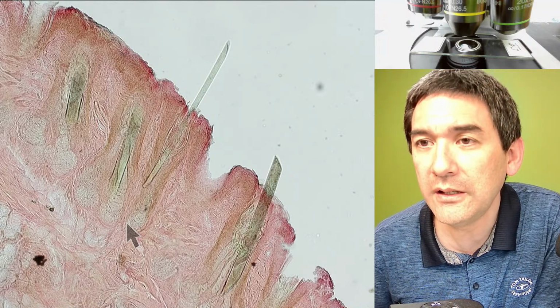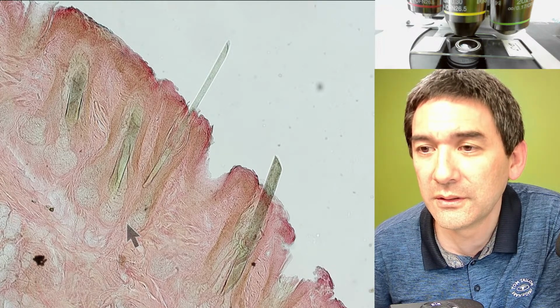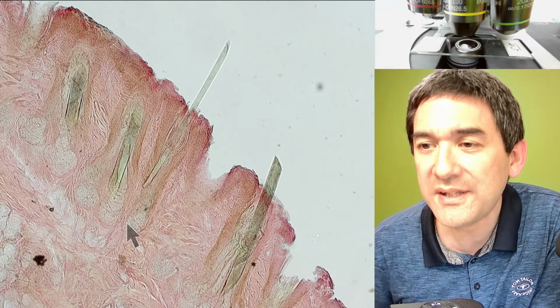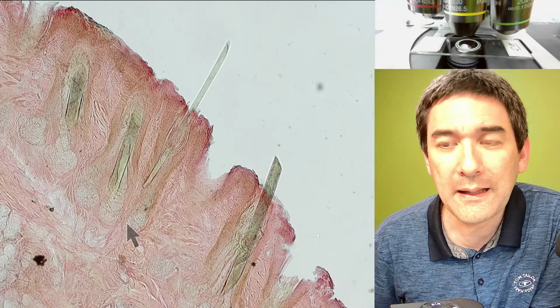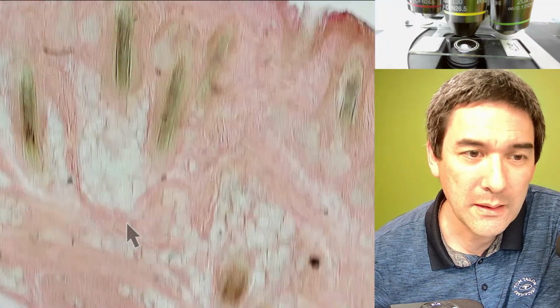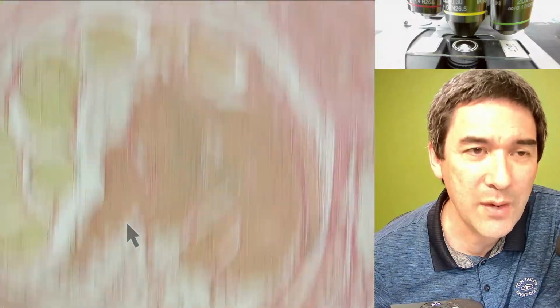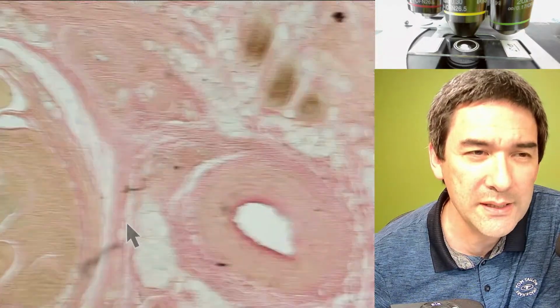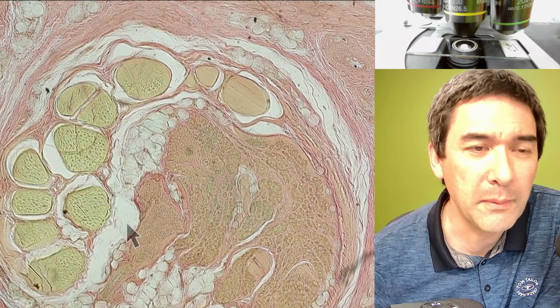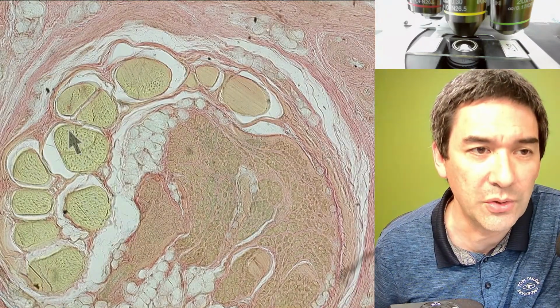Okay, let me quickly check again the comments here. Can we see nerves in the slide? Let's put it this way, I would not be surprised. But by the way, these here are tendons.